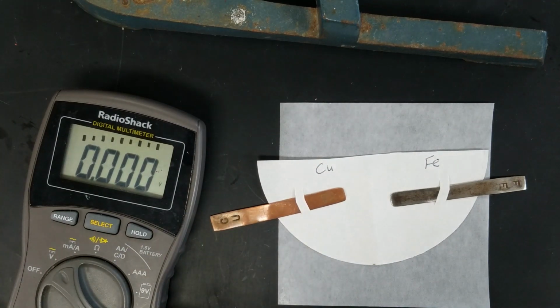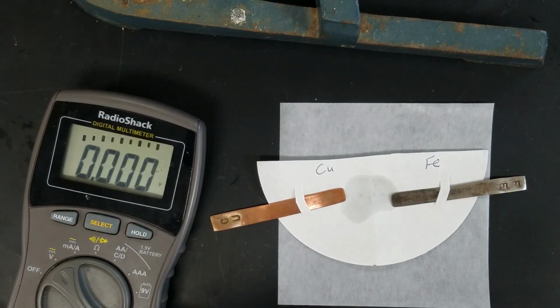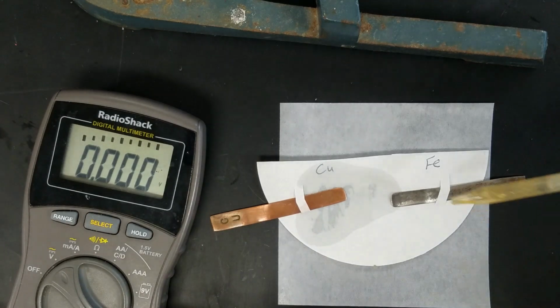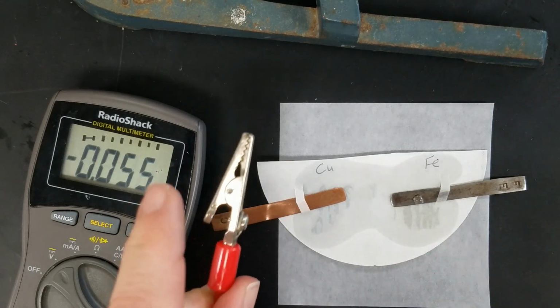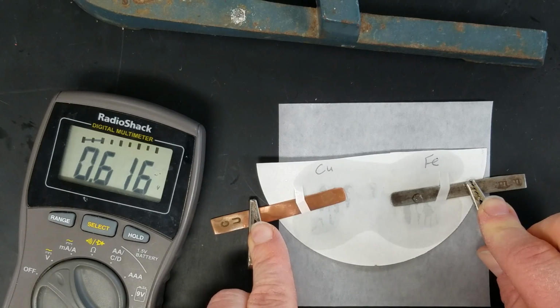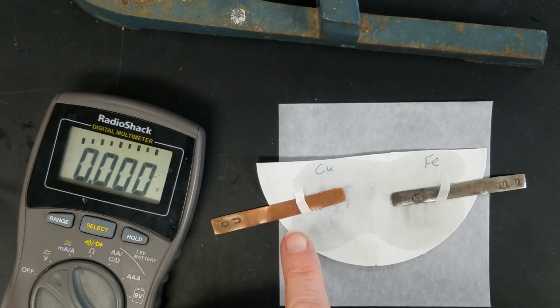All right, we're going to also do copper versus iron. Add copper to the copper side and iron to the iron side. Start with the red lead on the copper and the black lead on the iron. Record your value.